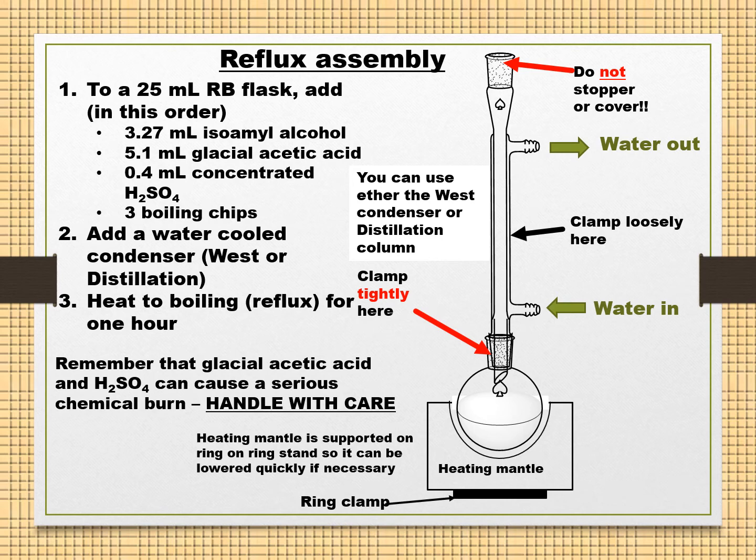While we heat, the appropriate temperature is very critical, and when you assemble this reflux, you can put your heating source on the top of a ring clamp, so that in case you notice any overheat, you can easily remove this heat source and recover your samples safely.